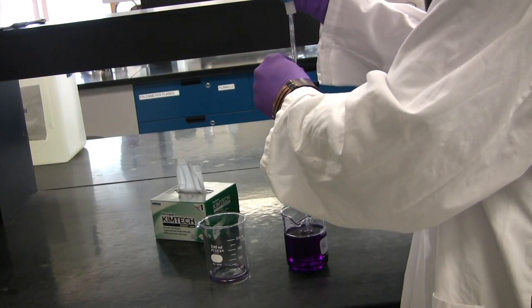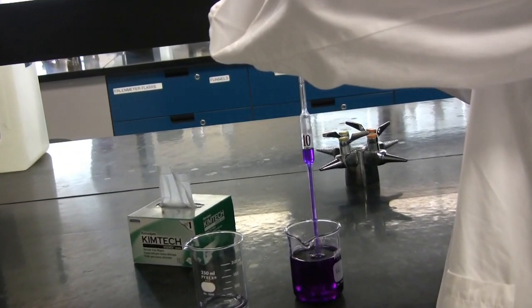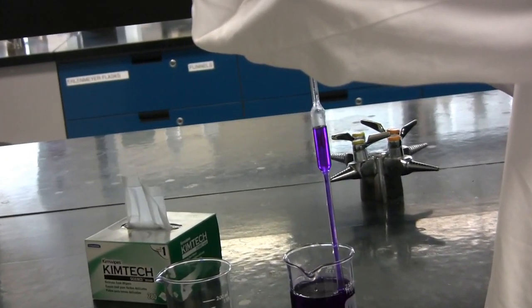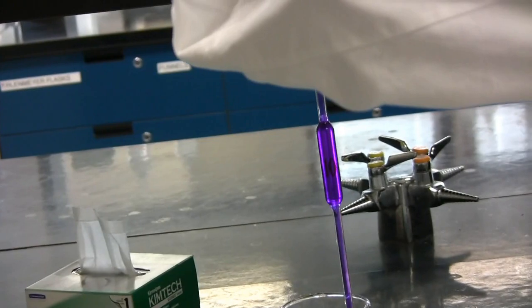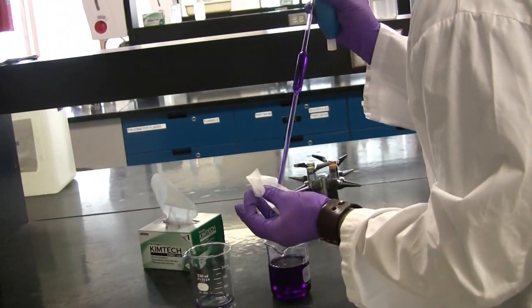Start by withdrawing your solution into the volumetric pipette. Be sure to stop just above the line, as you may contaminate the inside of the pipette bulb. Stop right at this mark and wipe off the excess on the tip with a kim wipe.